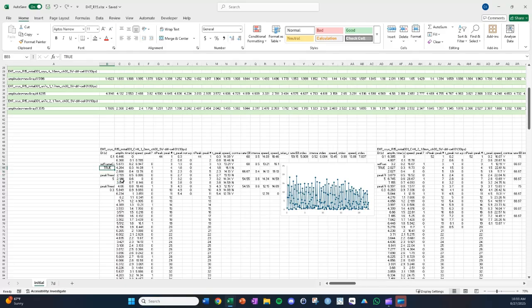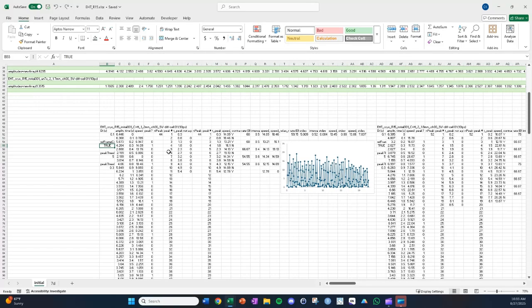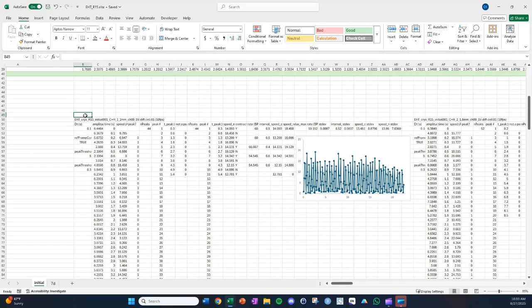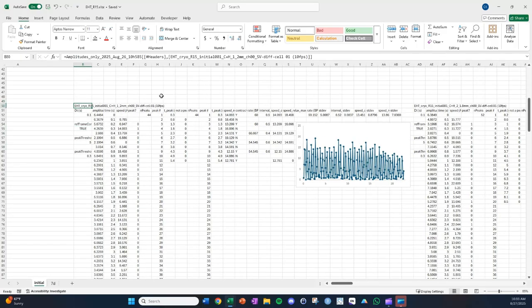But this is what I did, and this is what I recommend in part 1 for analyzing the tissue using MYOCYTER. So this is what I'll leave it at here. And for these videos, I took them at 10 frames per second. And just, I guess, one note on the video collection, I think ideally you'd want to do it on similar settings.